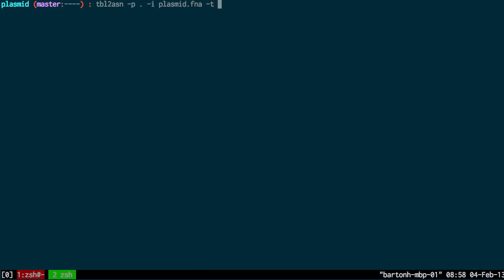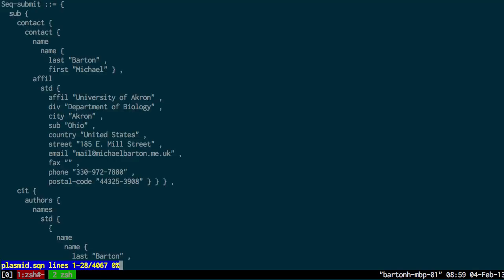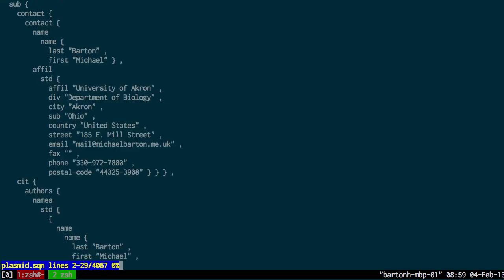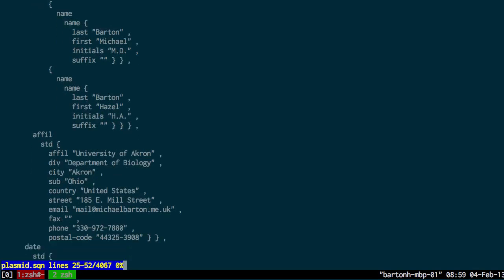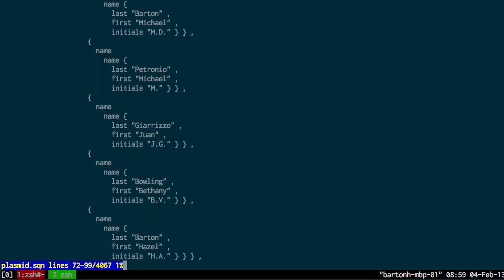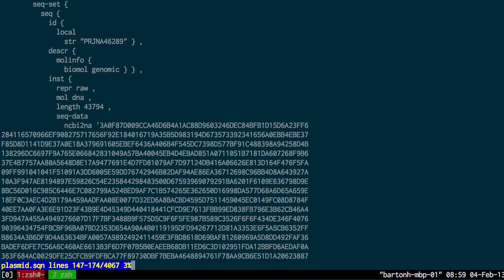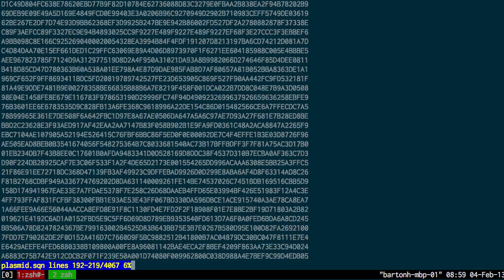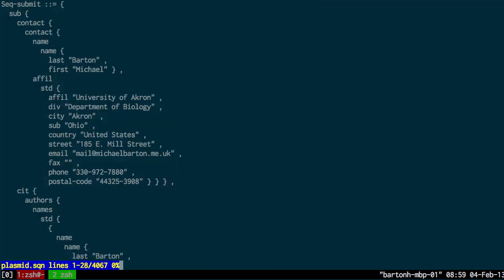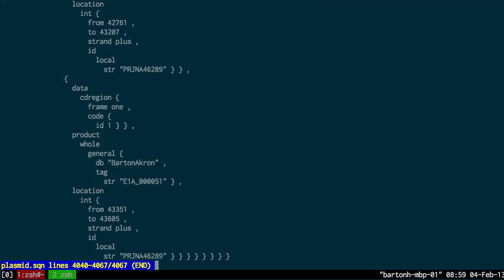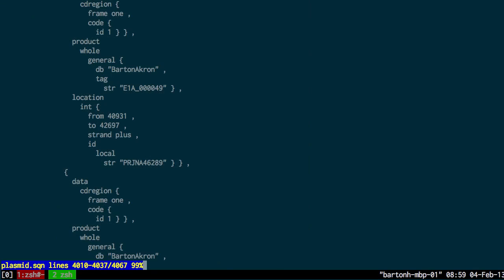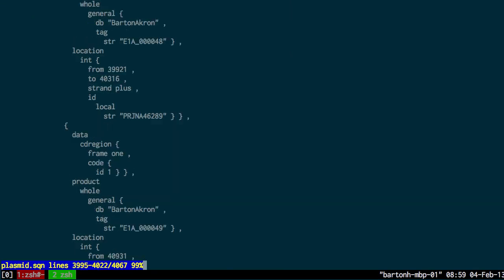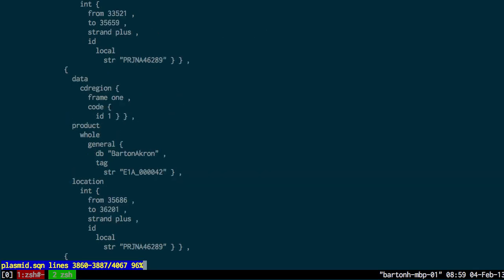That is with the slash T and then submission template. That should add that extra information. So now if I look at my plasmid sequin file, I now have this extra author information along with the plasmid sequence. And if I skip to the bottom, I have all the encoded annotations as well, which looks good.